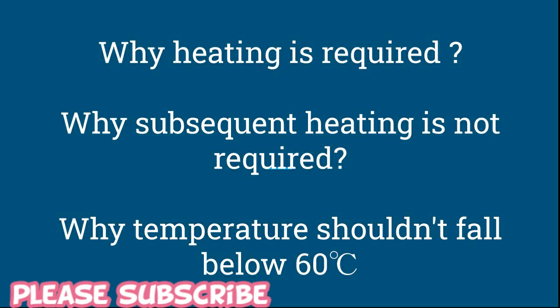Let's see why initial heating is required. Because the reaction of MnO4 minus with oxalic acid needs a high activation energy.